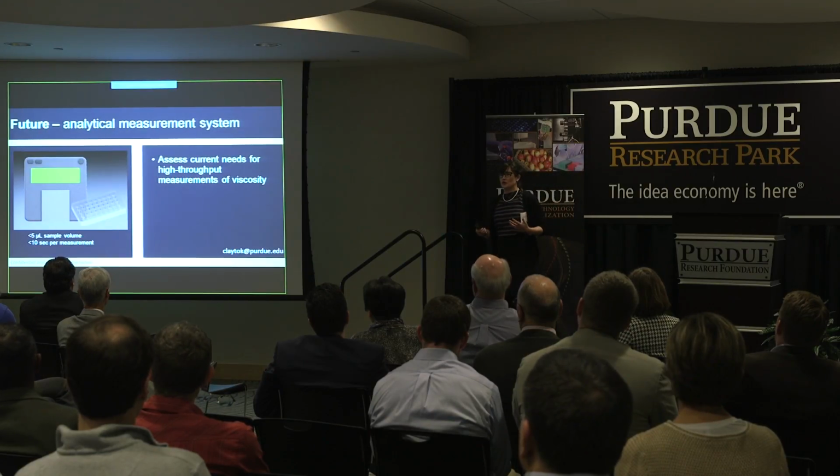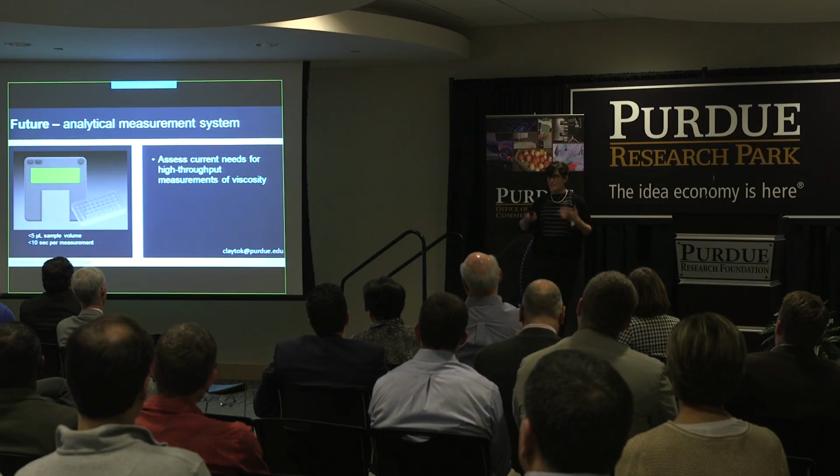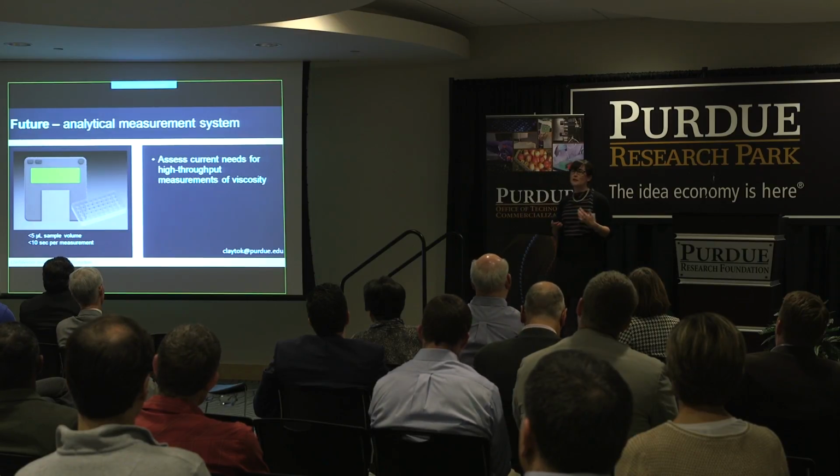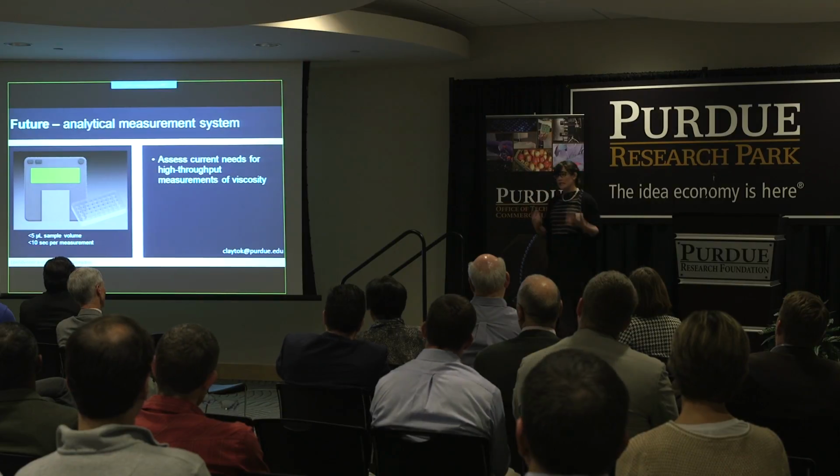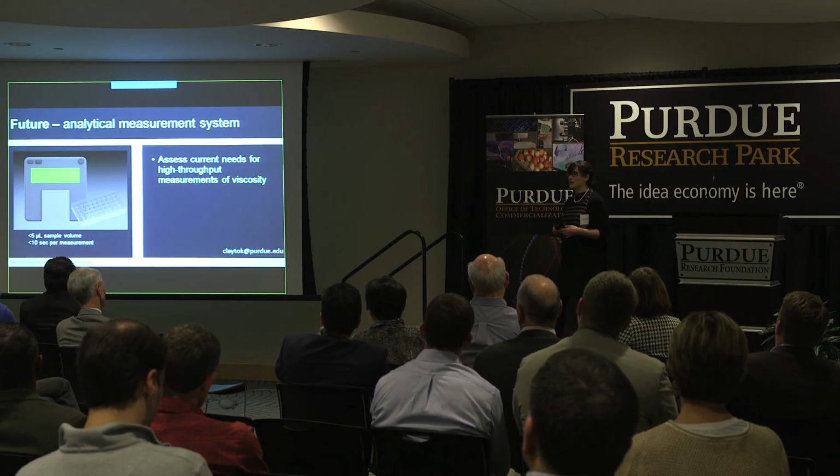So what we see for the future is providing a benchtop-based system in a 96-well plate format for high-throughput measurement of biopharmaceutical viscosity. And so from this, we'd like to talk to people in industry to assess the needs for a high-throughput system, as well as collaboration.